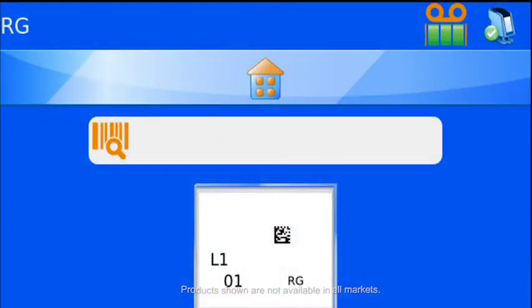Avoid unexpected delays. The new tape meter icon displays the amount of tape in the unit.